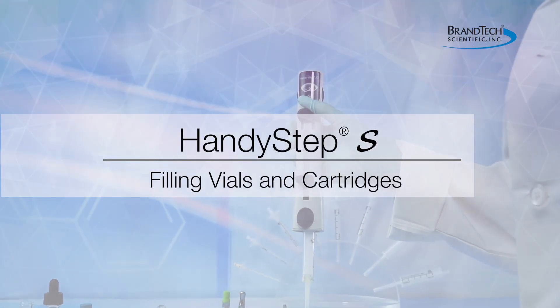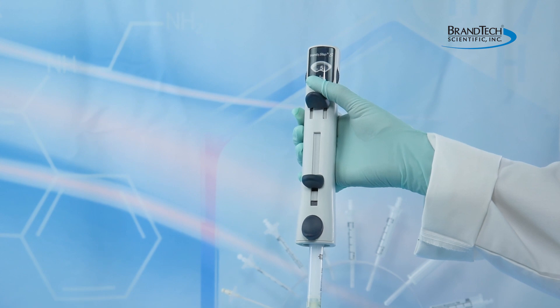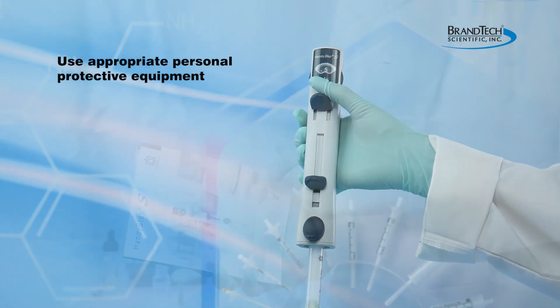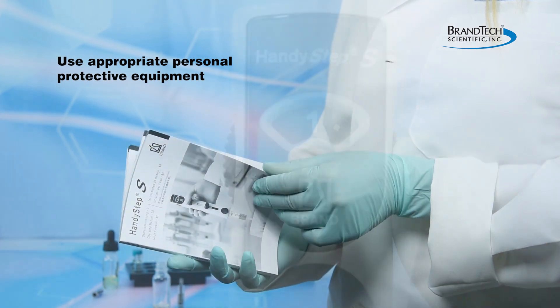This video illustrates the use of the HandyStep S to accurately dispense oils or other viscous liquids into vials and cartridges. This is a general guide and not a substitute for reading and understanding your operating manual.